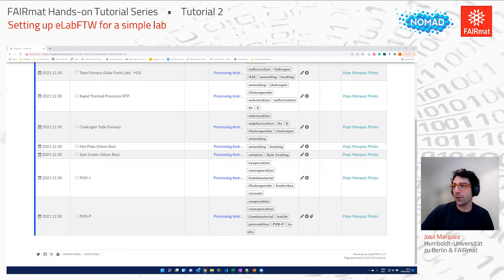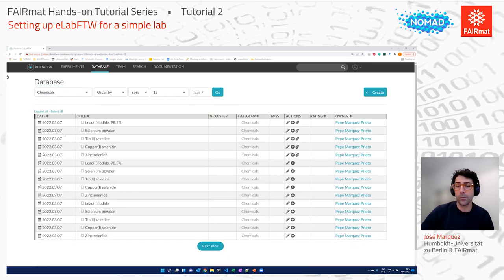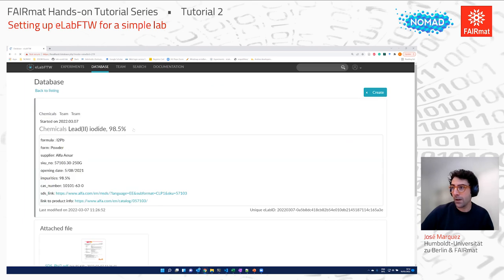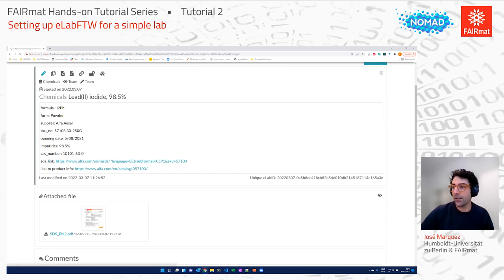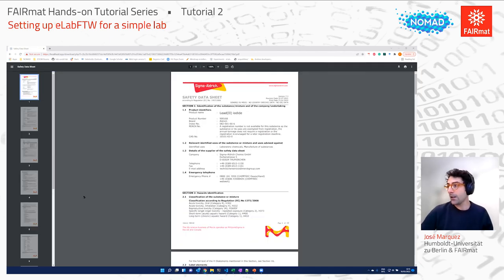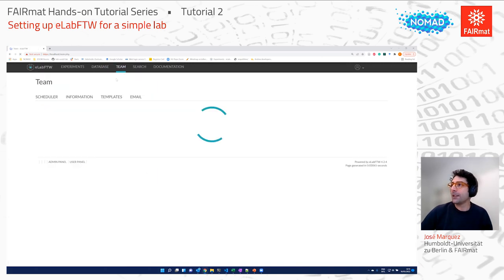Processing instruments work basically the same concept, just for processing instead of characterization. I can also show chemicals — the inventory of chemicals I have in my lab. I imported them from a CSV file. Each entry contains information like the formula, the form (powder), the supplier (Alfa Aesar), and the purity (98.5%). I also have a link to the safety data sheet, so if you're in the lab and unsure about safe handling of a chemical, you can check it straight away — which is quite convenient.